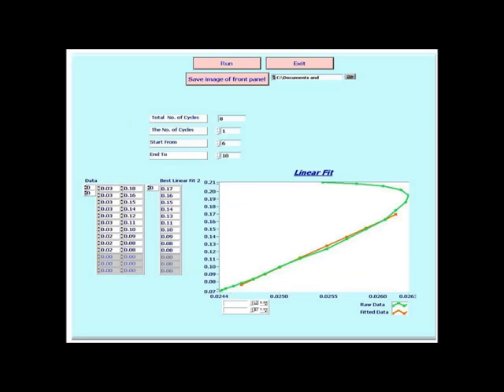The computer program determines the slope of each unloading cycle. Then the intersection of this line with the zero load line determines the value of plastic depth.